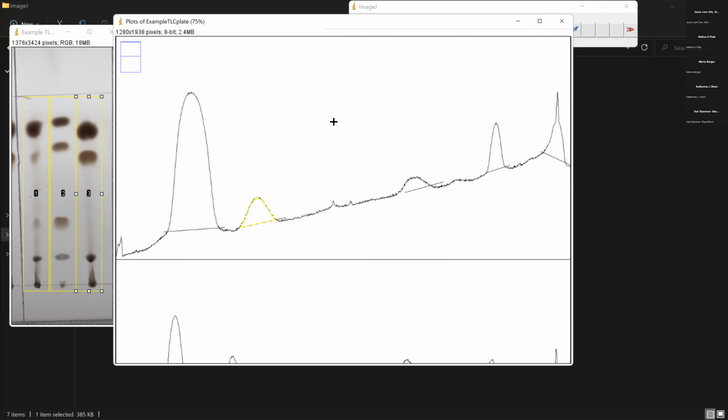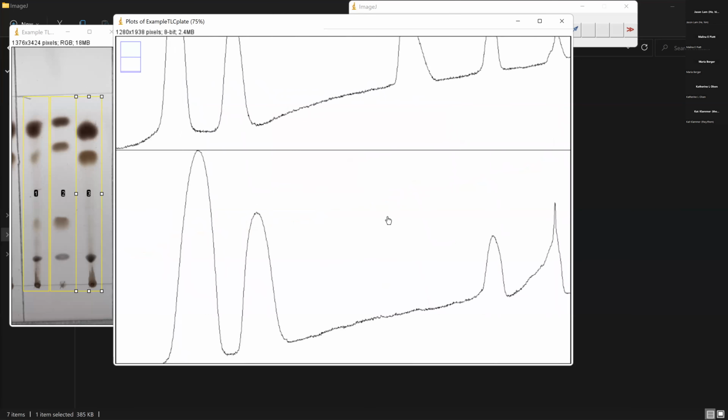So I'll do that and record, and then I'll show you what happens if I miss this line here. You'll see that the whole area under these peaks got selected. So that area is not accurate. It doesn't show what the area under this little peak would have actually been. It's going to give me a really huge area for this whole thing. So that's why we want to try to avoid that. So then I would go through and collect the areas for all of those. And then you'll do that again for the example pellet chromatogram, finding the areas for each of those.